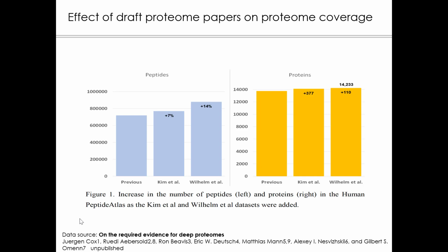So what we think is happening is that these papers over-predicted the number of proteins identified from the evidence, the spectra available. I will come back towards the end to describe why this happened and which part of the data analysis they probably did not sufficiently control. It's an explosion or an aggregation of false positive identifications in very, very large data sets. We also need to be very cognizant of this issue in the DIA world, and this has actually been addressed to a large extent, and I'm sure this will be discussed.